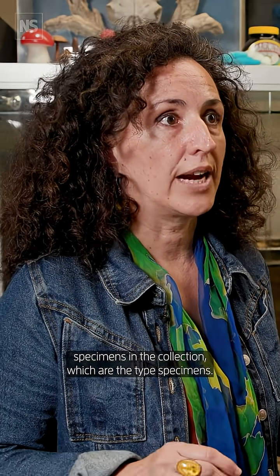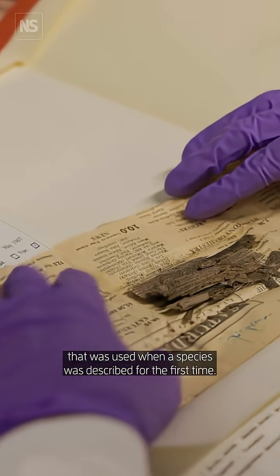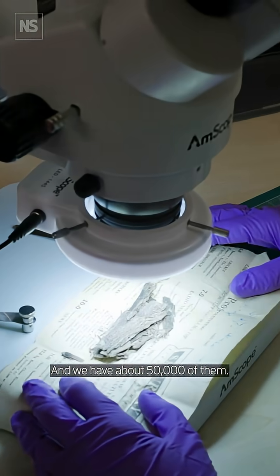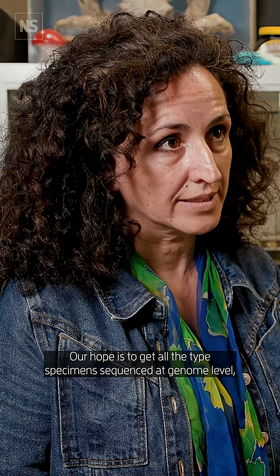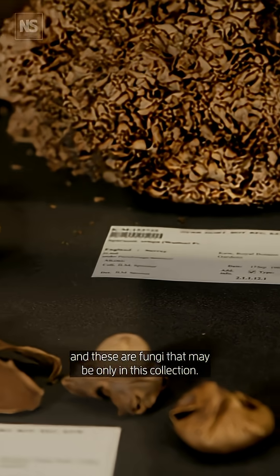We decided to target the most precious specimens in the collection, which are the type specimens. They are the physical specimen that was used when a species was described for the first time. And we have about 50,000 of them. Our hope is to get all the type specimens sequenced at genome level. And these are fungi that may be only in this collection.